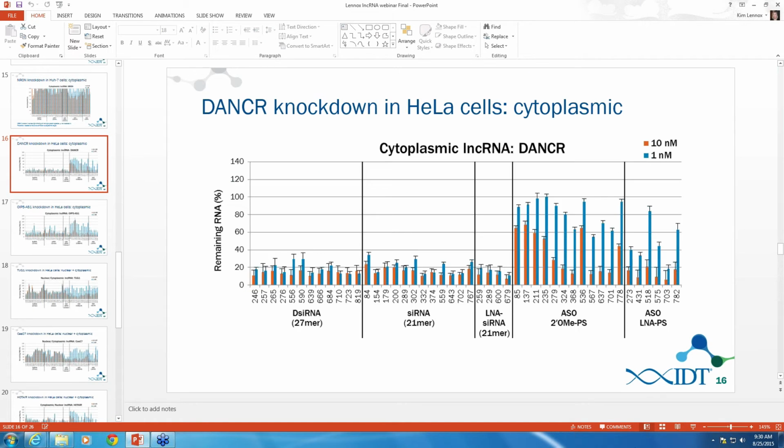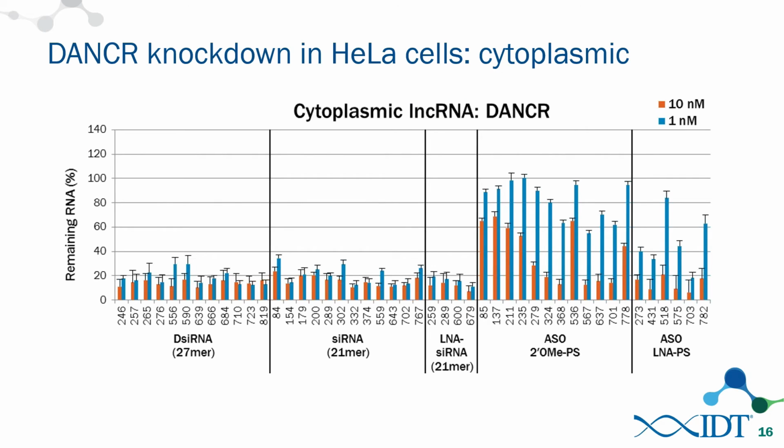Yes, structure can very much impact the efficiency of a knockdown reagent. When using RNA interference, there seems to be some assistance from the protein machinery in being able to unwind the target in order to increase its accessibility, while antisense oligos rely exclusively on thermodynamics to do so. When these were all designed, we actually looked at target structure using UNAFold and tried to design the antisense oligos in accessible regions that were already open, to try to limit that bias. But if you went in there blindly designing antisense oligos, yes, structure can definitely impede their ability to bind to and knock down the RNA.